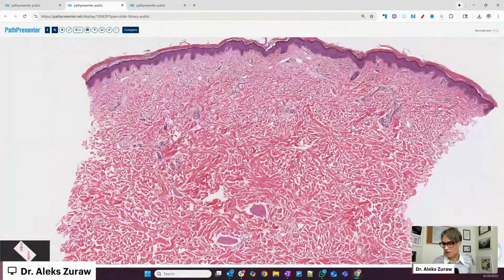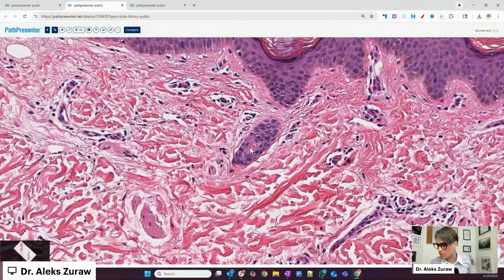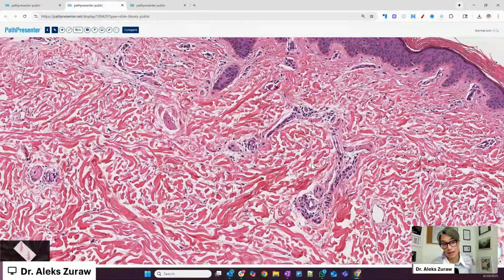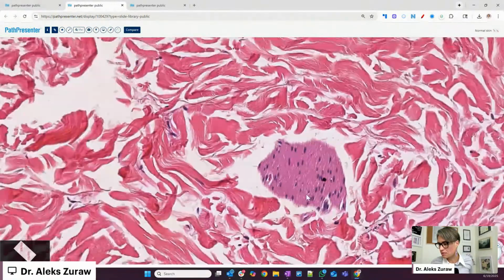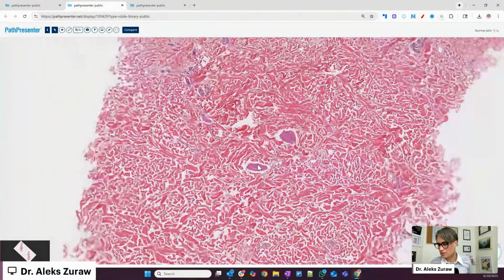We're going to find hair follicles if there is hair. I don't know, we don't have any hair here. Maybe that was supposed to be, I don't think so. But we're going to find also glands, eccrine glands and apocrine sweat glands, and maybe some corpuscles, Ruffini and Pacinian corpuscles. Actually, I have not seen them, but they should be there. But we will find nerves. So, for example, this could be a nerve. Yeah, I think it's a nerve. That's what we're going to find in the dermis.